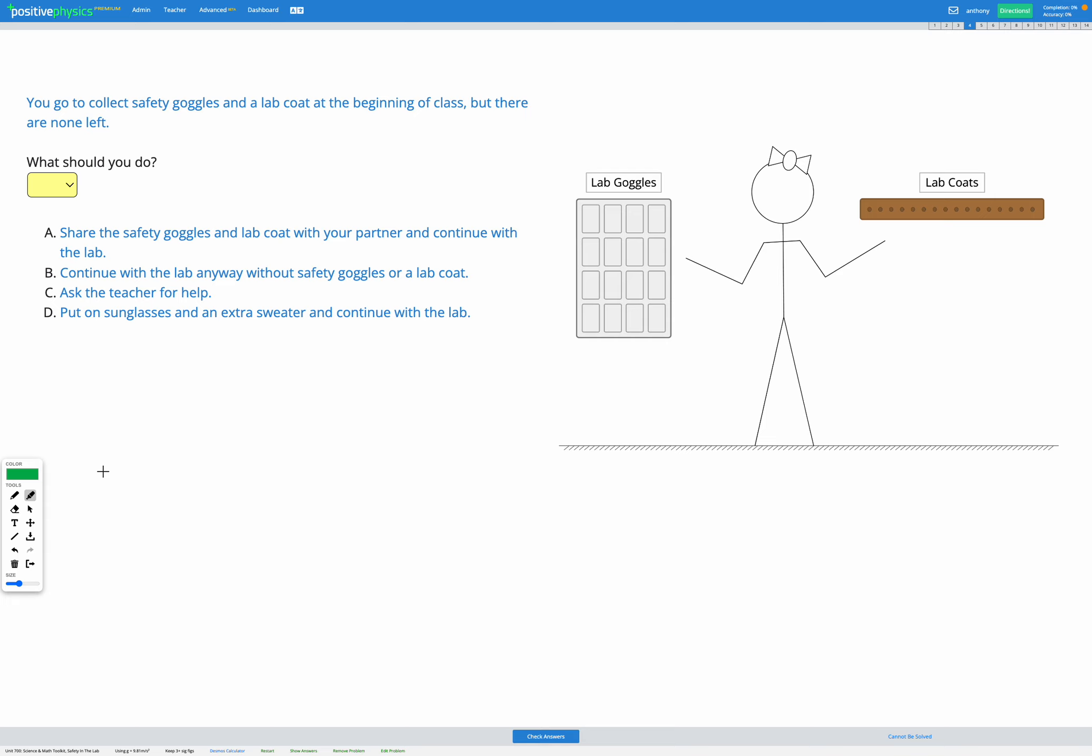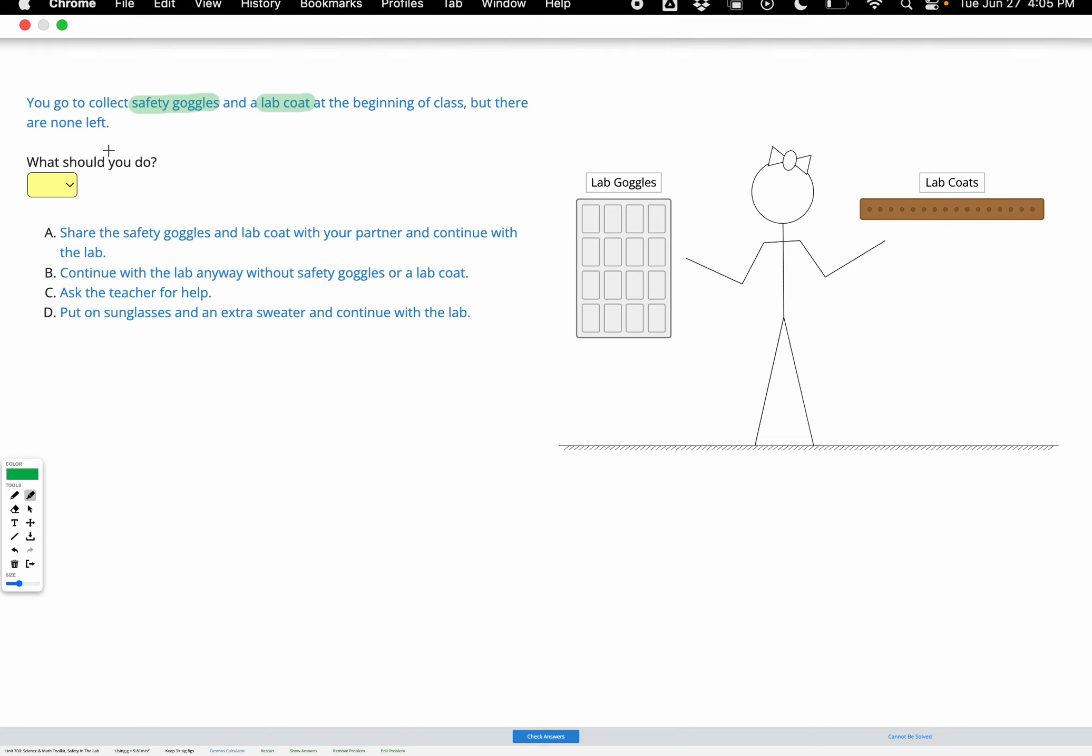In this question, you're provided with a real-life lab scenario, and you need to decide what's the best course of action to take. So in this particular question, a student goes to collect their safety goggles and their lab coat at the beginning of class before they conduct a lab, but there are none left, as you can see in the image.